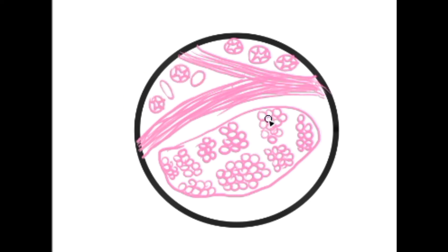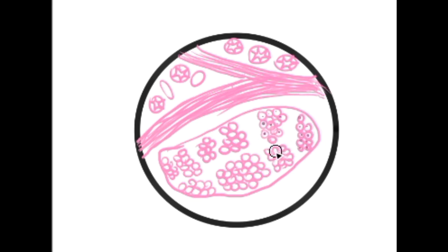The cells also contain glycogen. These cells have centrally located nuclei that can vary from small and hyperchromatic to large and vesicular.